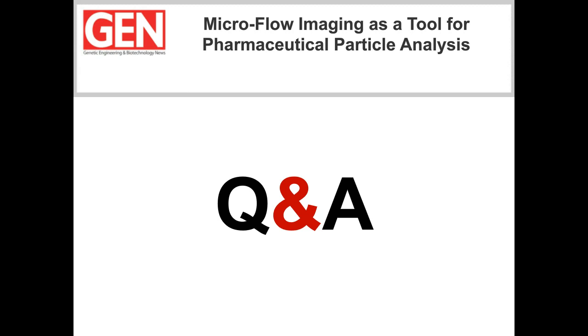And indeed, we found an explanation for the presence of the fines during our first case study, as I showed during the presentation, in which we studied the effect of different process steps on PLGA microparticle characteristics. So it's very likely that the presence of the fines is the result of collecting the solidified particles over a sieve during the production process of PLGA microparticles. And from the number size distributions before and after sieving, it really looks like the fines were part of the original size distribution before sieving, and then sieving reduced the number of fines and contributed to the gap in the size distribution. So MFI really provided this information. I hope this answers the question.